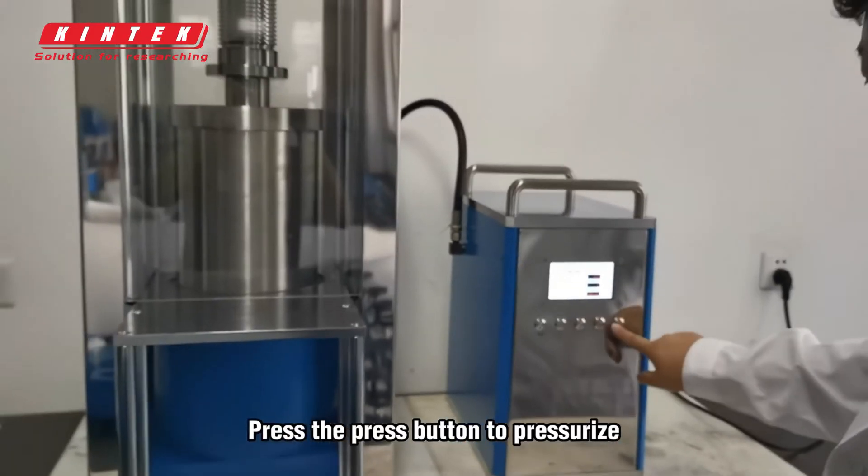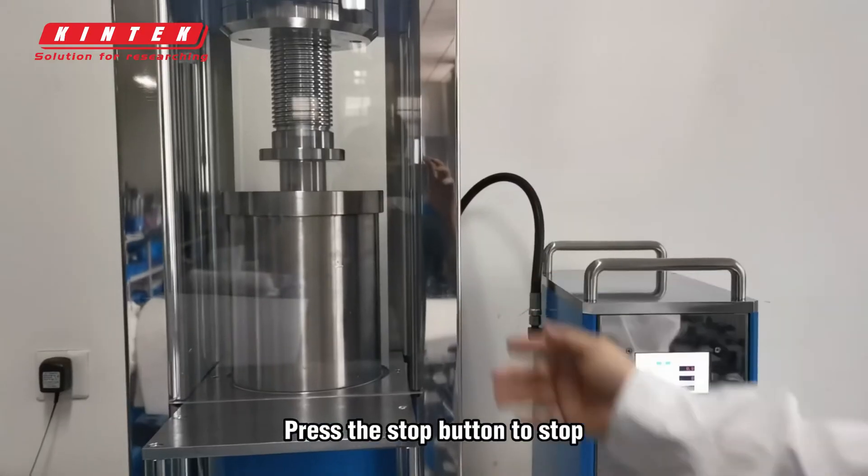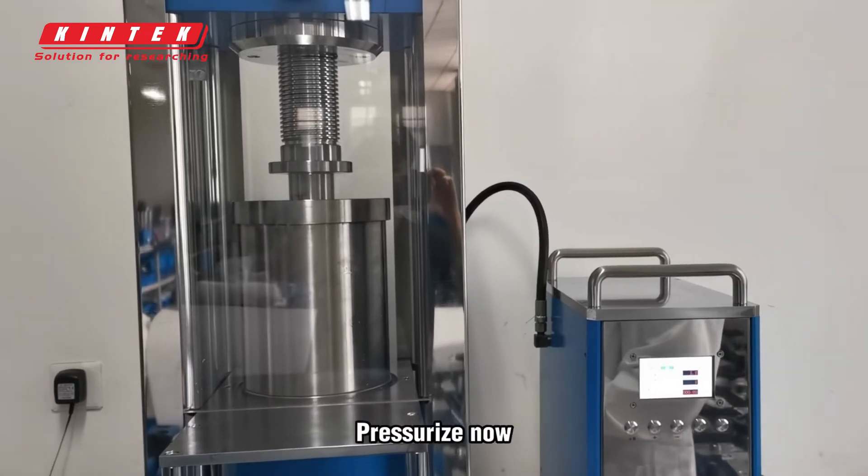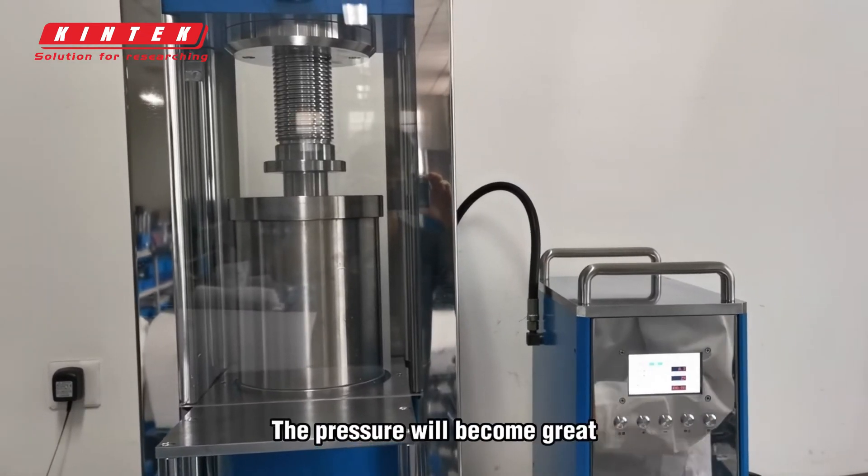Press the press button to pressurize. Press the stop button to stop. Now I will show you how to pressurize the machine. Pressurize now — the pressure will become great.